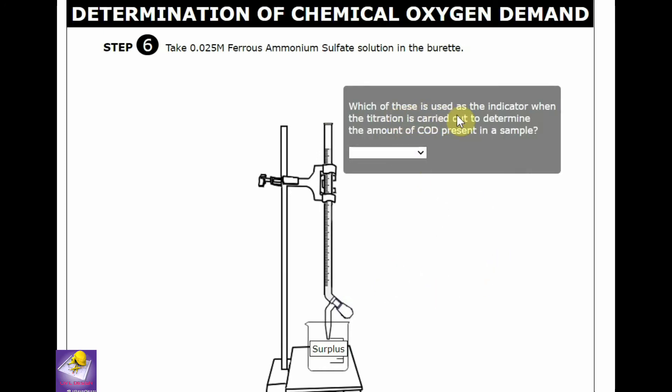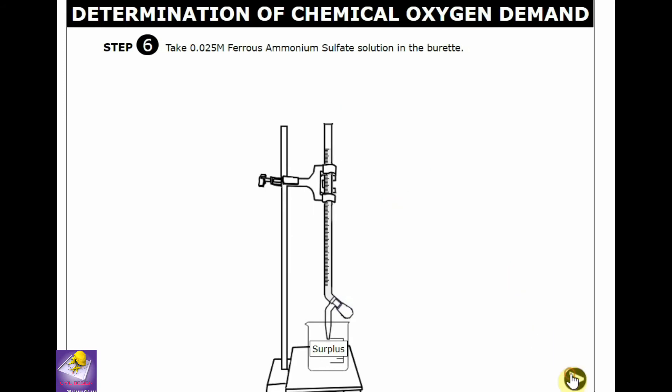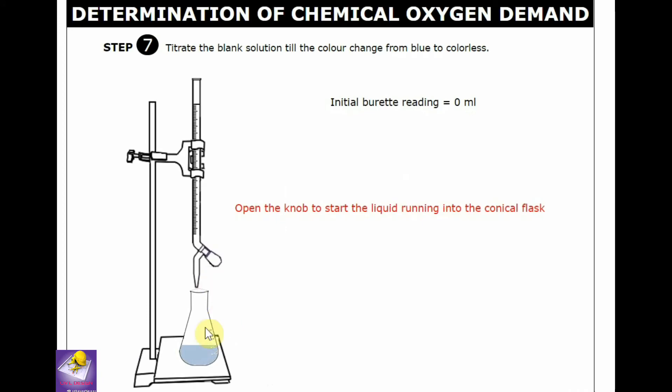Which of these is used as indicator when the titration is carried out to determine the amount of COD present in sample? The ferroin indicator. Now start the titration. Initial reading is 0. The titration is carried out till the color changes from blue to colorless.